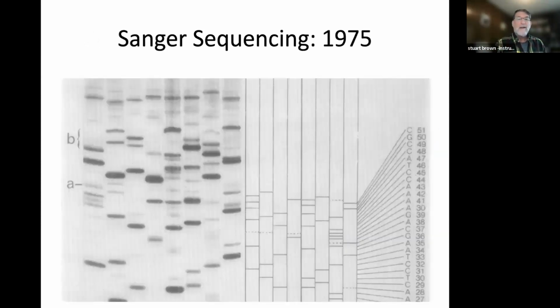Now, when I started in molecular biology, we did DNA sequencing like this, where you ran 4 reactions for each of the different bases, and you stopped the replication, or a certain percentage of the replication, at each base. So you got fragments of different lengths. You labeled the last base that was added. It was both a label and a polymerase stopping base, a dideoxynucleotide.